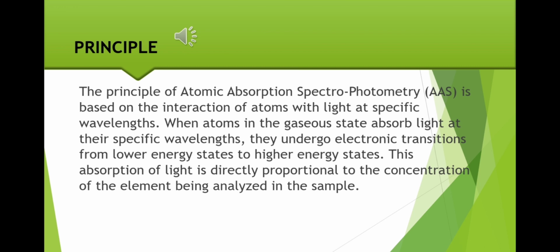Its working principle is based on the interaction of atoms with light at specific wavelengths. When atoms in a gaseous state absorb light at their specific wavelengths, they undergo electronic transitions from a lower energy state to a higher energy state. This absorption of light is directly proportional to the concentration of the element being analyzed in a sample.